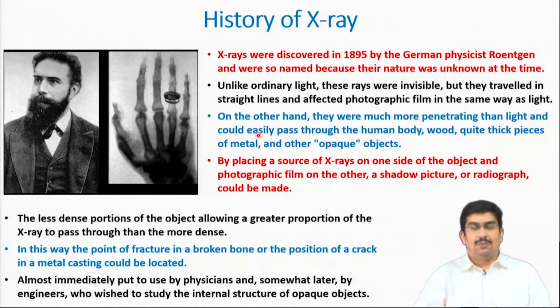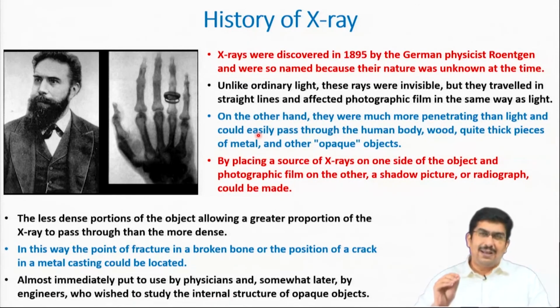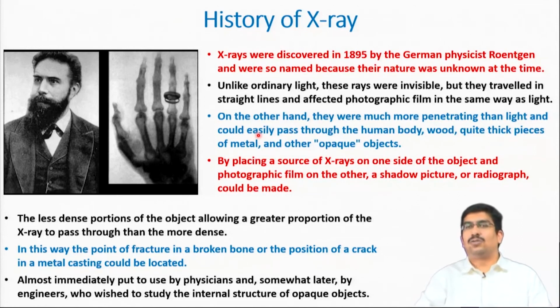But with that, we will start our discussion about X-ray signal, X-ray diffraction, and we will restrict ourselves mostly to X-ray diffraction. Although we will very briefly discuss the X-ray imaging part, that is X-ray tomography, computerized tomography, mostly we will restrict ourselves to X-ray diffraction, and we will certainly not go into XPS, that is the chemical analysis part of X-ray.